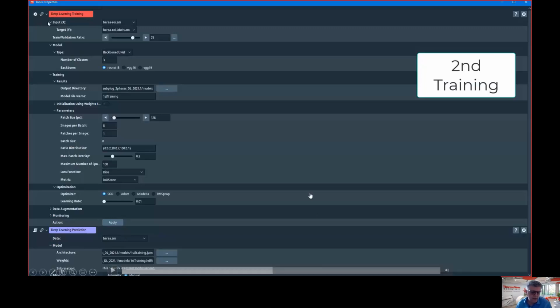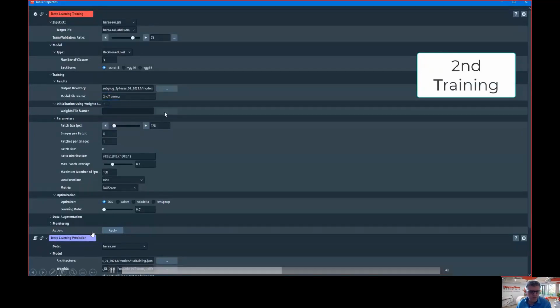You still need a GPU, of course, but we have a sort of mechanism to adapt. The prediction is more robust and can run on a small machine. The training is really an intensive task.